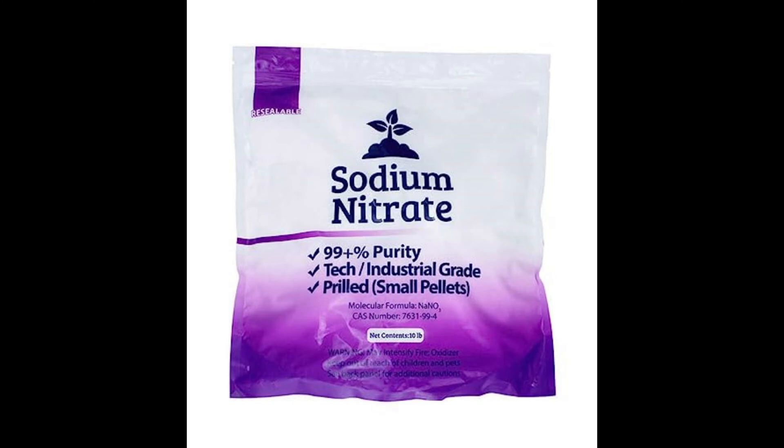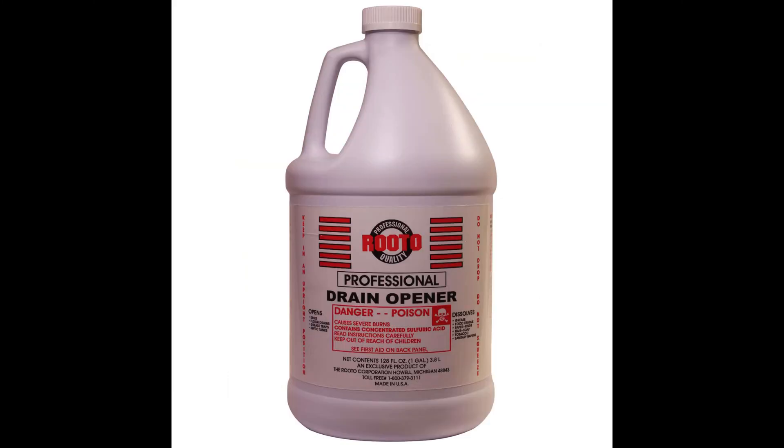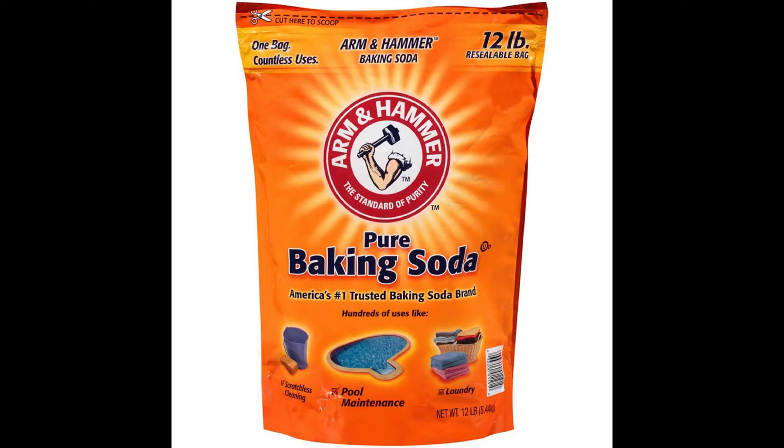I like sodium nitrate or potassium nitrate, and any high-concentrated drain opener that's sulfuric acid will work. You'll need some baking soda for your cleanups.